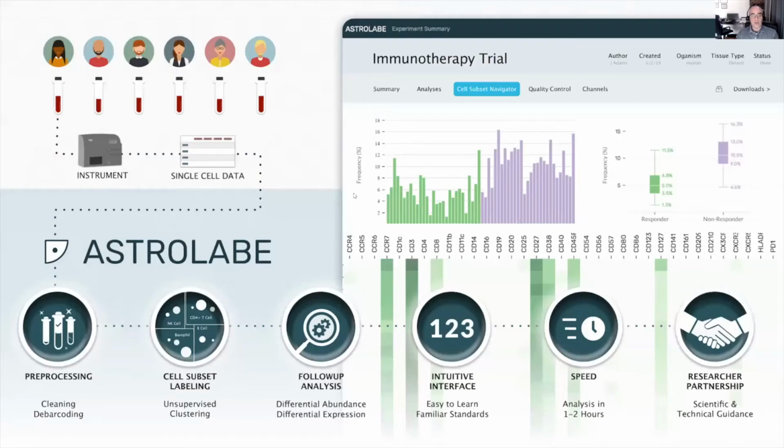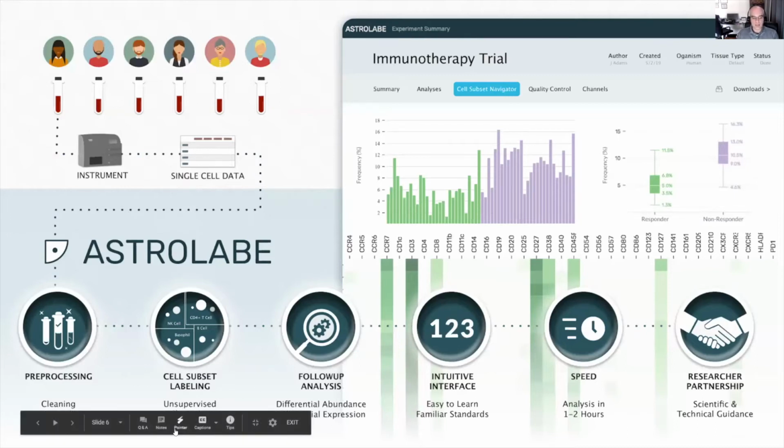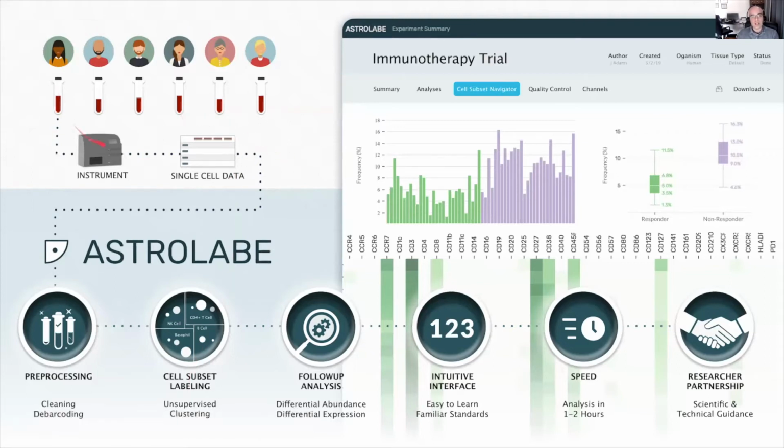So what is Astrolabe? Astrolabe is a one-stop shop for analysis of flow and mass cytometry data. The idea is that we integrate into your existing experimental workflow. So you acquire your data, whether it's human or mouse or non-human primates, and your instrument can be the CyTOF, the Aurora, or the LSR2. Then the data goes on the platform, which takes care of every step of the analysis pipeline.